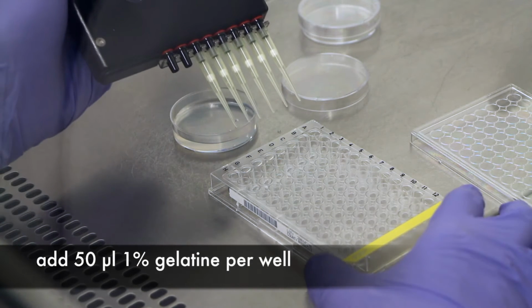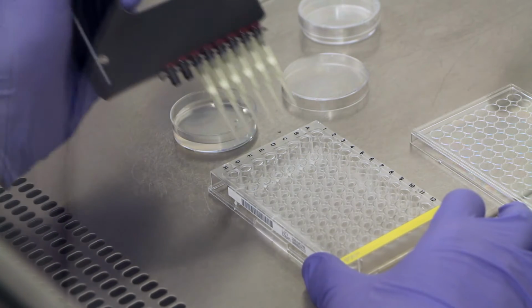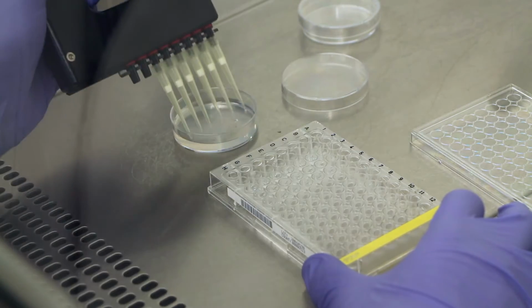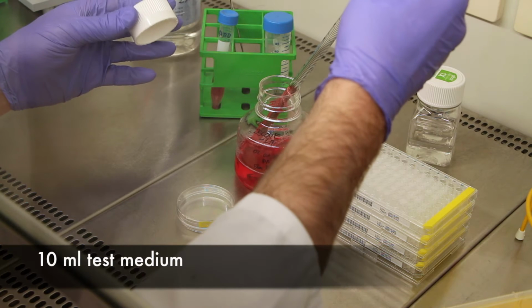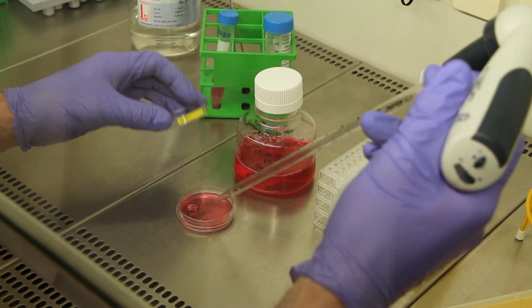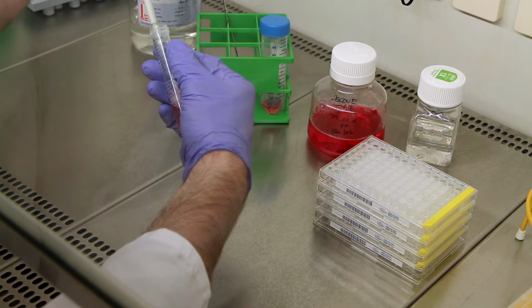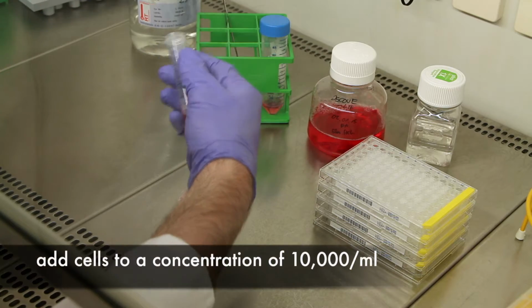For the proliferation assay, 50 microliter of 1% gelatin are added to each of the wells of a 96 well plate. The gelatin enhances adherence of cells to the bottom of the wells. The plate is incubated for 2 hours. A small petri dish is filled with 10 ml test medium. The cell suspension previously created is diluted to a target concentration of 10,000 cells per milliliter.